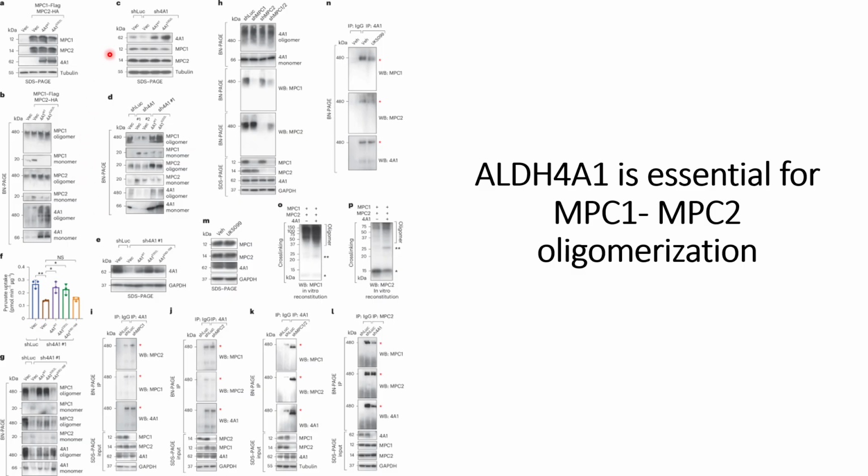Thereafter, in this panel C, they wanted to check whether the actual levels of MPC1 and MPC2 get affected when ALDH4A1 is knocked down or reintroduced. In this case, they can see that the levels don't get affected much compared to the controls.